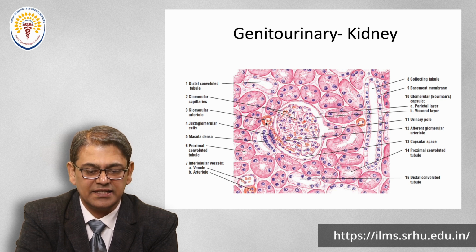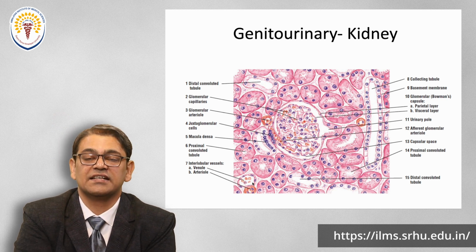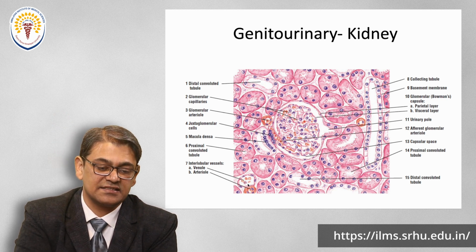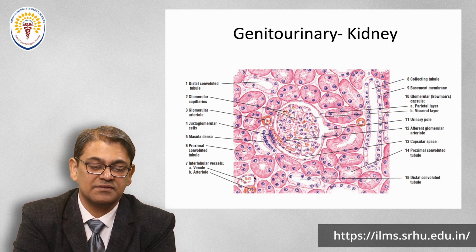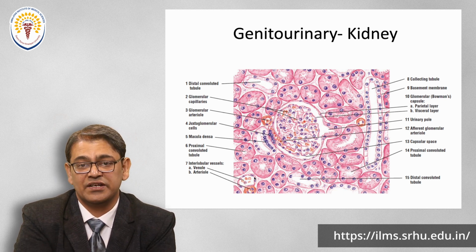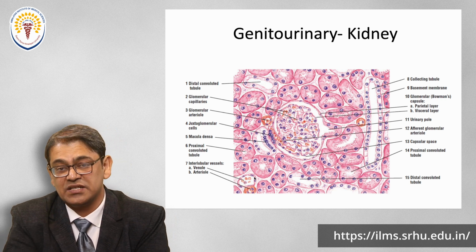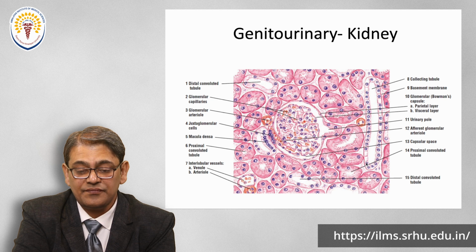Okay, there is another vein and other structures present. How do I identify this is the artery and this is the vein? Do you remember the lecture on the veins? Go through that and see the vessel structures. Yes, the thick wall is the artery, and the thin wall is the vein. Since this is the microstructure level, we do not call it artery or vein; we start calling it arteriole at this level and venules at this level.